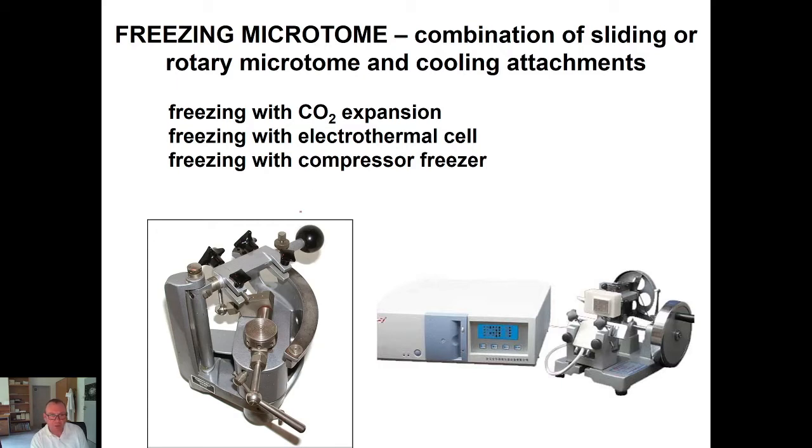Here should be a knife in this place, and here is a specimen, a frozen specimen, and movement of this handle here in this direction leads to formation of a section.